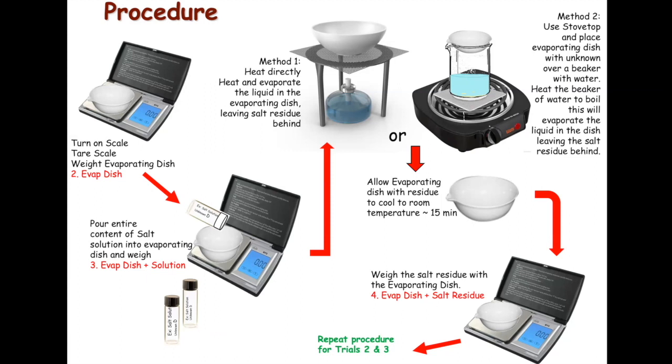In experiment number 4, you guys had some 3 items on the bottom, and you had ice on the evaporating dish, and then you sublimed one of the chemicals. This is similar, but now you've got salt solution in that evaporating dish. What you can do now is heat up the evaporating dish directly if you have an alcohol burner, or you start boiling the water. And you'll see that in the video.